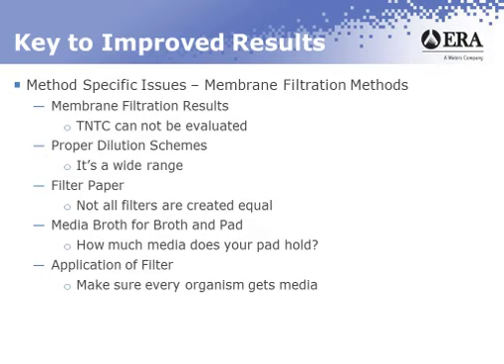Once you've completed rolling it on, a good practice is to tap the Petri dish on the lab bench. That'll add an additional kind of contact between the two. If you don't have a good contact between your filter and the pad, your organisms will not grow. They don't have the nutrients. They're sitting up there with no lunch, so to speak.